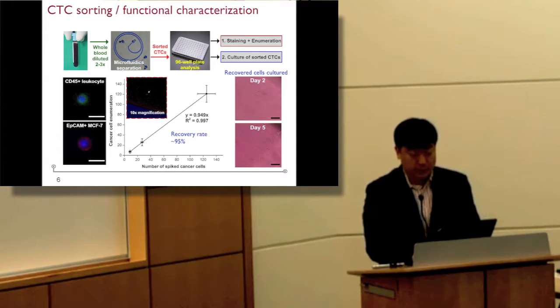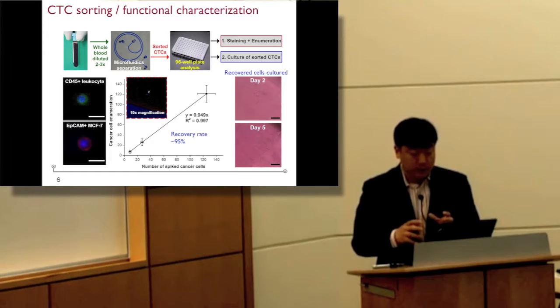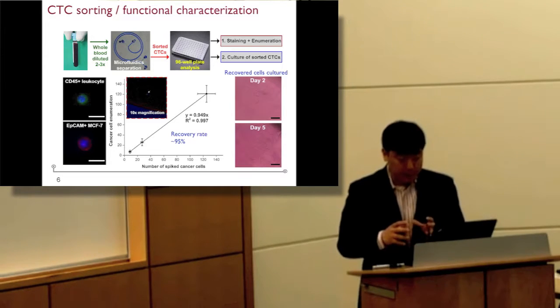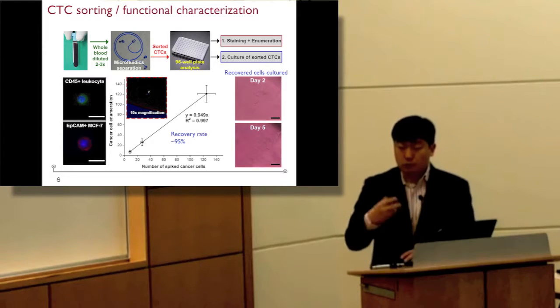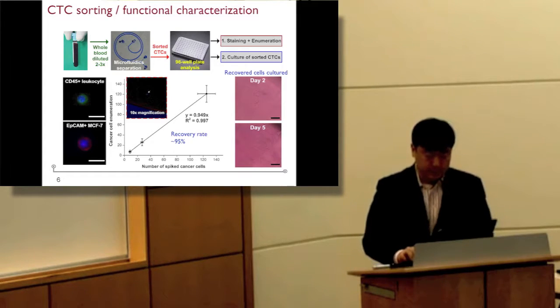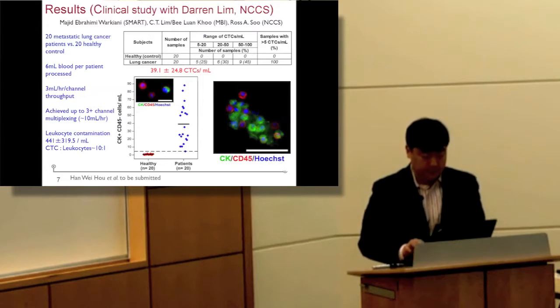We can put them on the 96 well plate, we can try to culture them in whatever matrices or conditions. One point that I want to make is that this is really a sample preparation device that can be used to collect the rare cells. And the recovery is the strength of this technique.